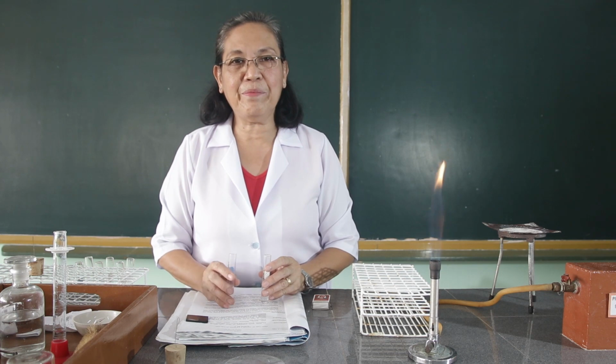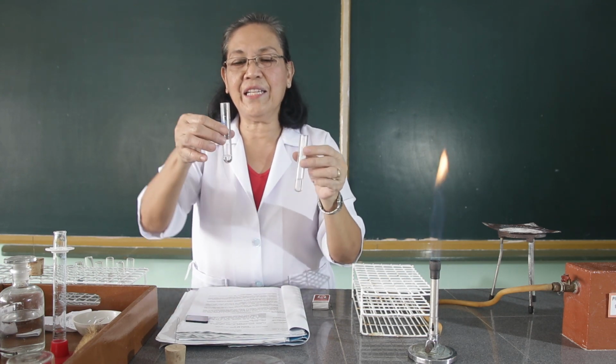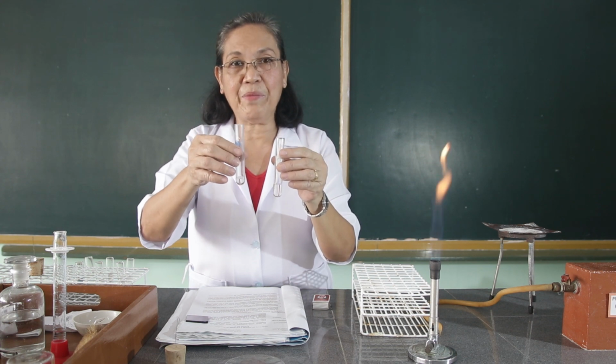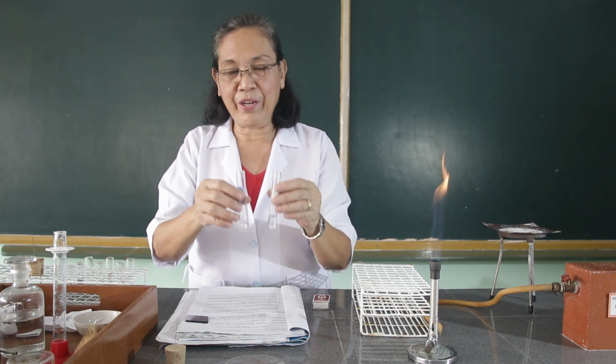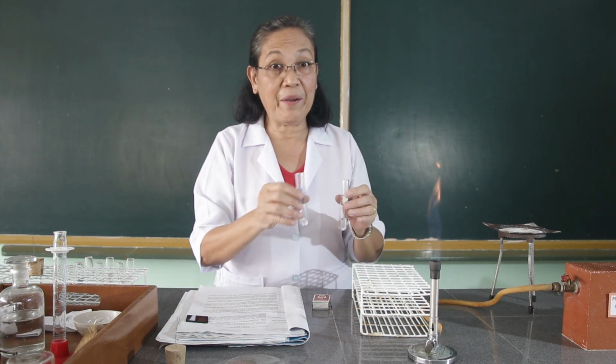Then we're going to mix the solution of the sodium carbonate and the potassium carbonate. And we are going to observe the flame imparted by these two when they're placed together.